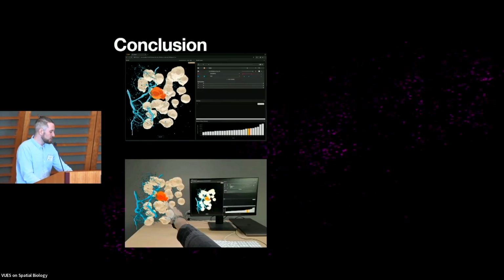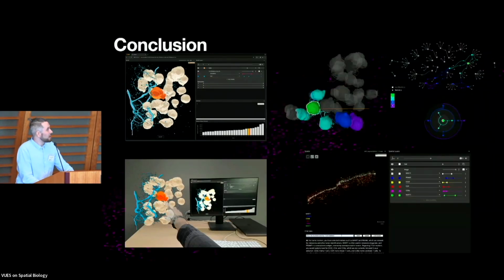So to summarize, I've shown you some XR, AI, and visual analytics approaches that we can now use together in these 3D tissue maps. Yeah, and I'm very happy for questions now.